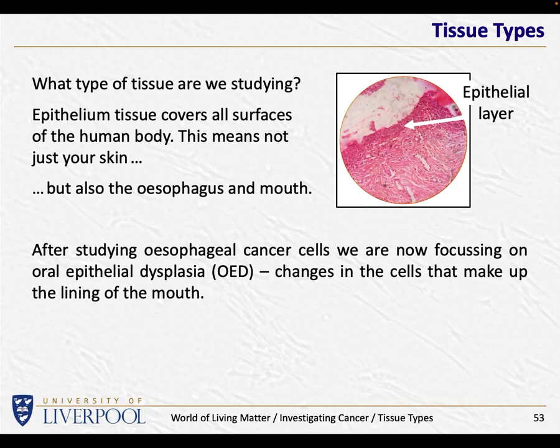This looks okay and will remain okay, or this looks okay but is going to become a problem, because we can then avoid unnecessary surgery and make sure patients are treated. We want to avoid undertreatment and we want to avoid overtreatment. We want to get the prognosis as accurate as possible. And it looks like at the moment we're working towards a system where the prognosis from the analysis that we can do on infrared absorption is better than can be done by histopathologists.